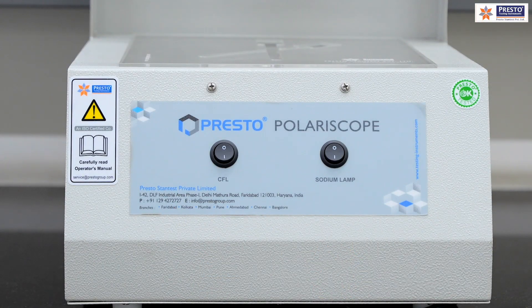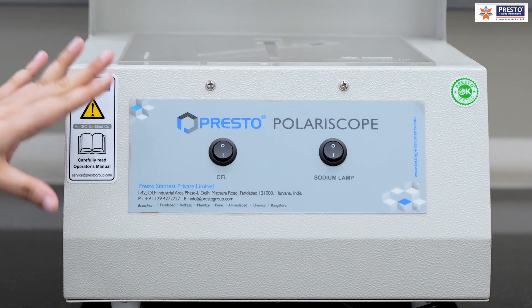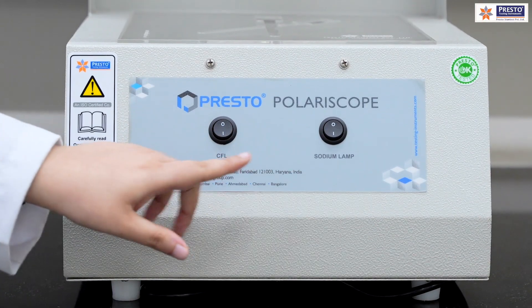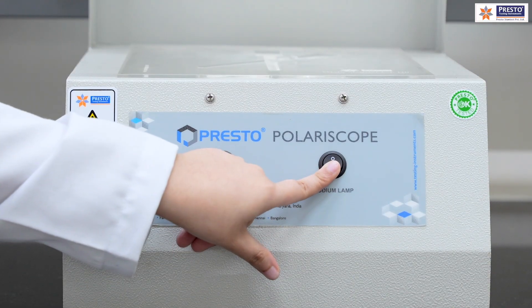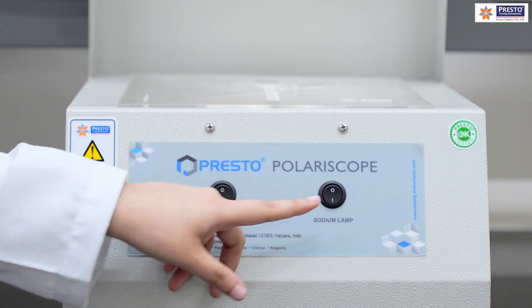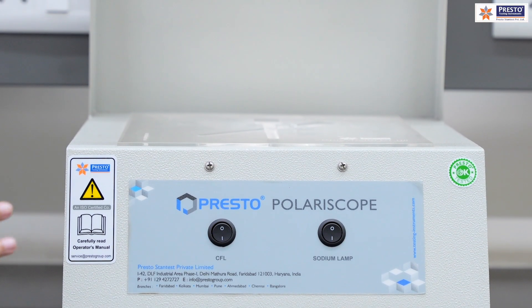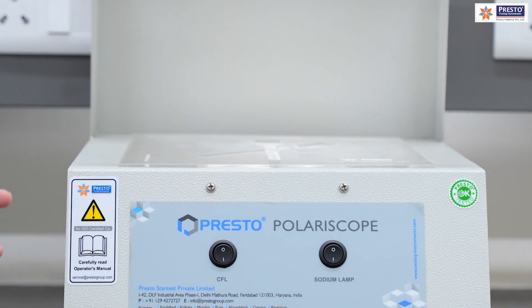Now we will discuss the labeling of the machine. This panel has two light sources: the first is a CFL light source and the second is a sodium lamp. When we switch on these two light sources, we get polarized monochromatic light which will not disperse and will travel in a straight line, giving us accurate stress analysis.